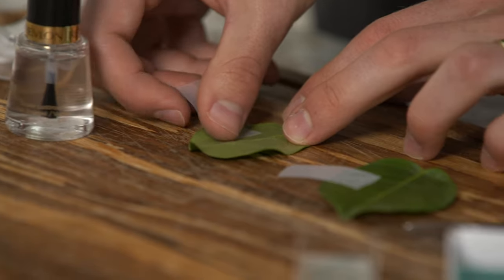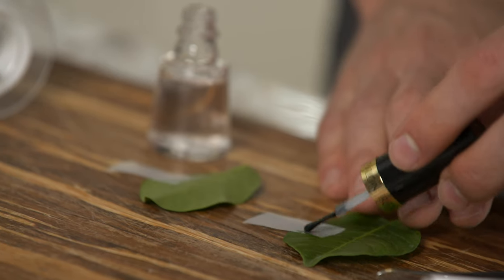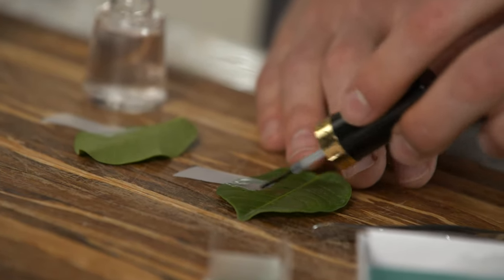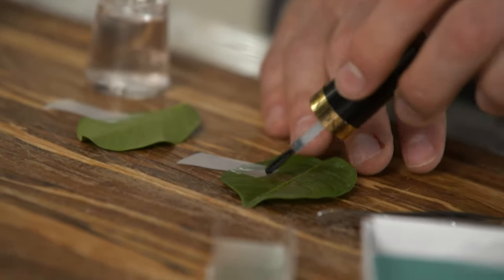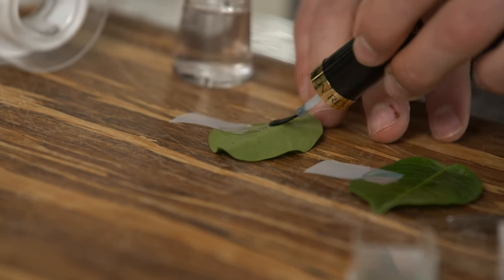Next, we'll apply a thin coat of clear nail polish across the top of the tape and onto the leaf. We need about 1 square inch of polish, with half on the leaf and half on the tape. Wait for the nail polish to dry, and then repeat on the bottom of the leaf.